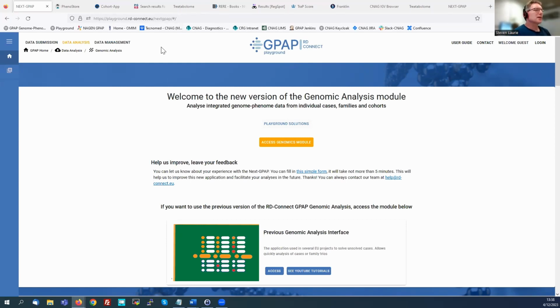Mattis had one, but I think Alberto's just addressed it about the cohorts, or who are the cohorts visible to? And Alberto has responded that they're visible to the creator and the users belonging to the same group, a GPAP, and that we're working to extend the permissions as done for studies in the new interface.